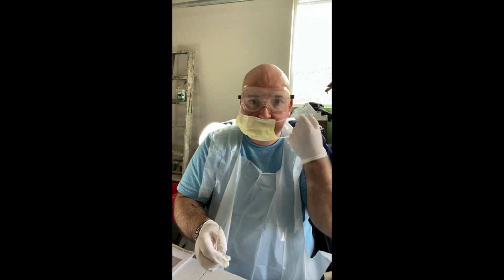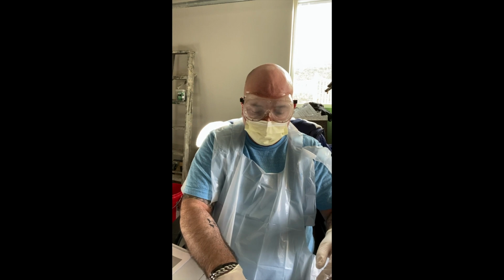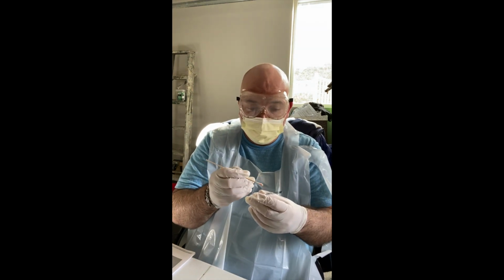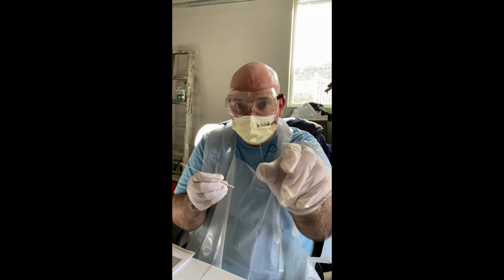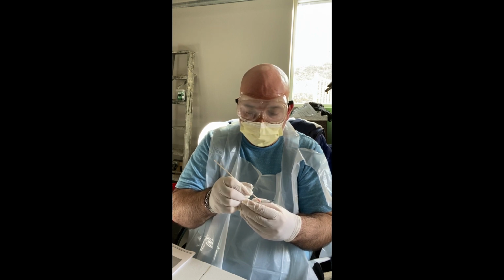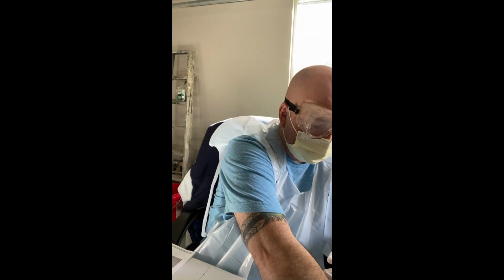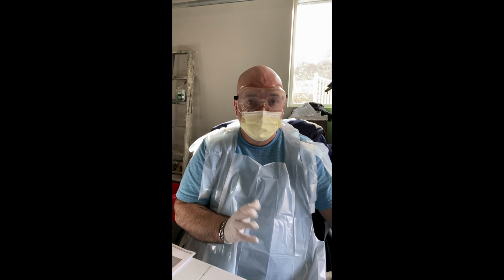So now, let's put this back on. I have my slide here facing upright, and then I'm going to smear my sample in the center, just in the space that I created by drawing that circle. And I'm just going to smear it in a circular motion, just to make sure that I have a good sample distribution here. Okay, so there's that. So I'm going to set this aside so I can dispose of it later. And now I do need to let this slide completely air dry.